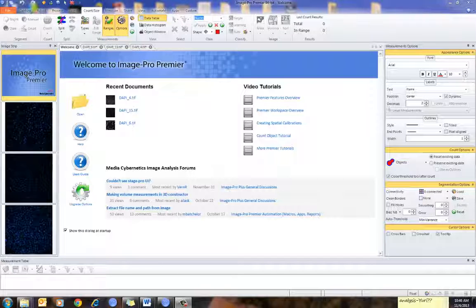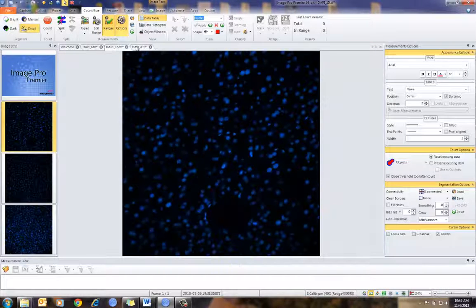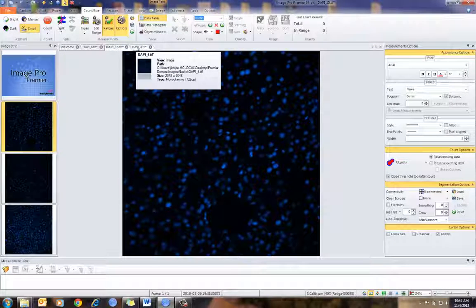For purposes of this video, I have already set up a method on how to segment and count my nuclei or objects of interest. To learn more about the count and size features, please see the related videos on count and size. So at this point, I'm going to go to count and size, and I'm going to show you the images I have already counted. These are nuclei, and I already have count and size set up.